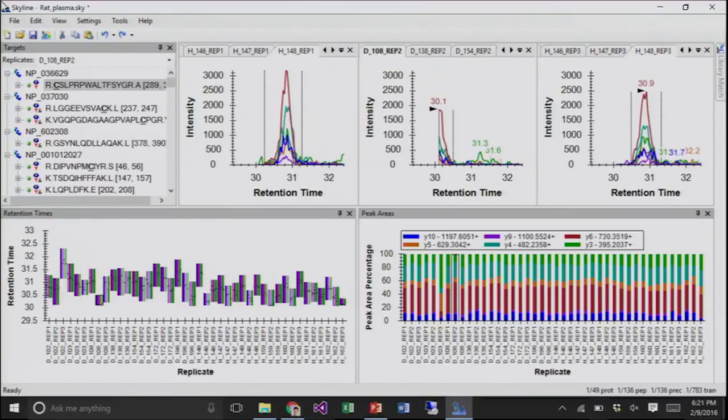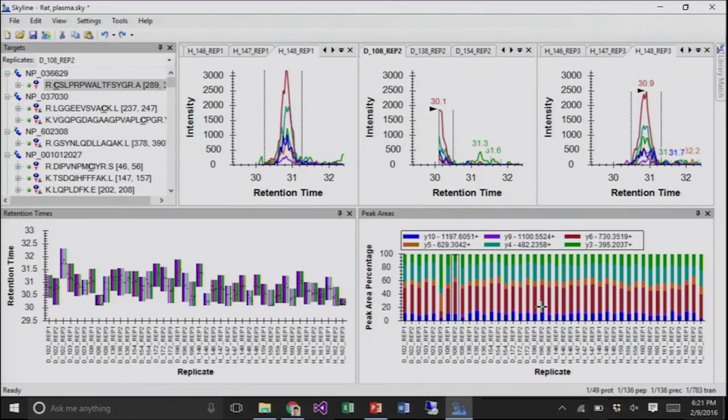How about anybody? What else? Is there anything that doesn't look like the rest? There is this replicate free D103. Which one? This one? No, on a level. The replicate free of 103. 103 replicate 3. Yeah, exactly.